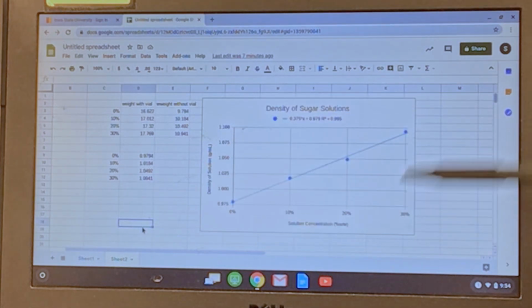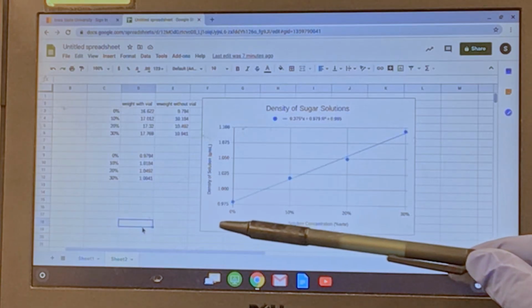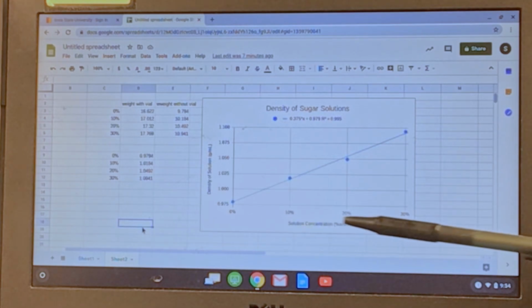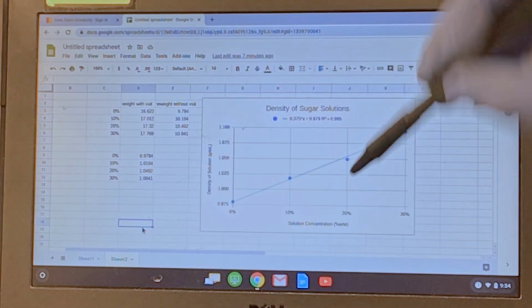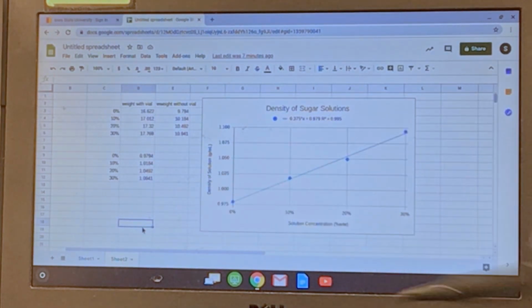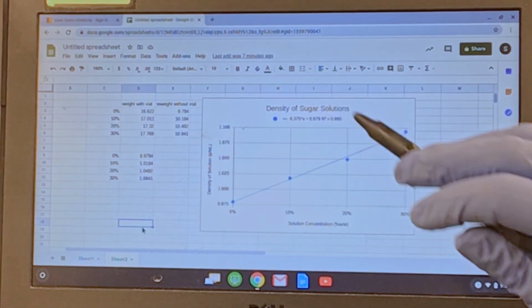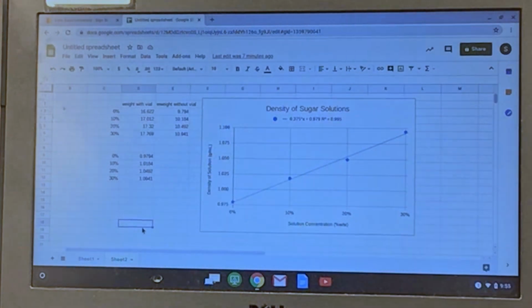So what does this graph tell you? That the density of sugar solutions, at least from 0 to 30%, increases linearly as the concentration of the solution increases, okay? So that's how you represent your data, with a good title of the graph, the titles of the axes, what they represent, with their units, the equation of the best fit, and the r square. One more piece of information: what do you put on the x-axis and what do you put on the y-axis?